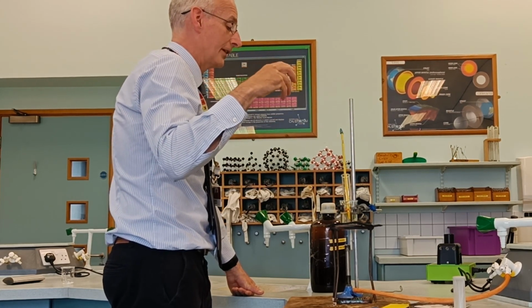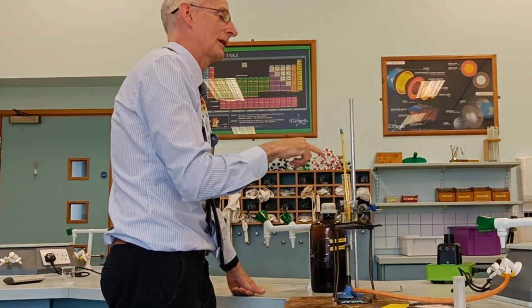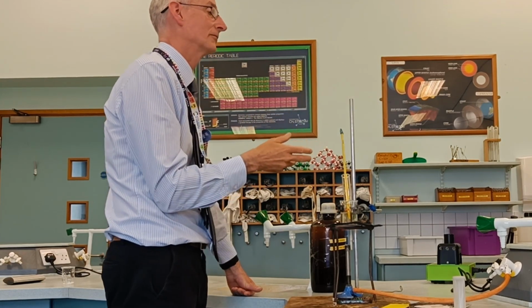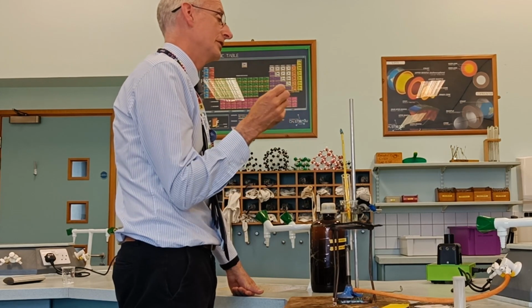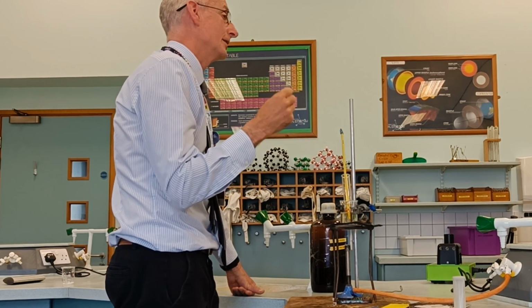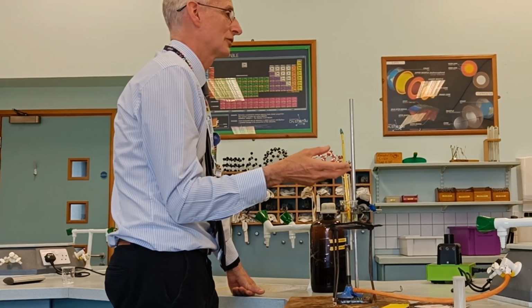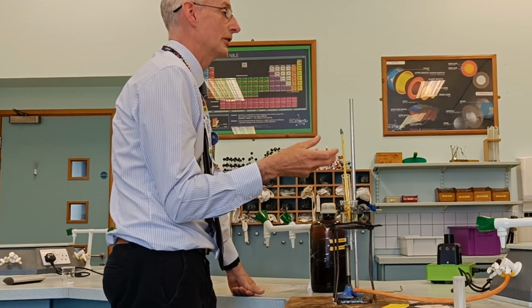But what you want to do is to make sure the thermometer is reading the actual temperature of the sample. If you heat it too quickly, the thermometer hasn't really caught up with the temperature of the sample, so you get a poor reading. So you can heat it nice and strongly to 110, 115. Okay. But at that point, you need to slow things down.